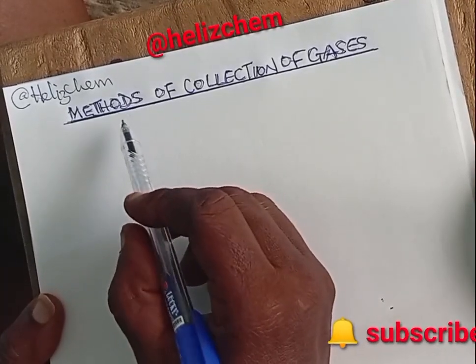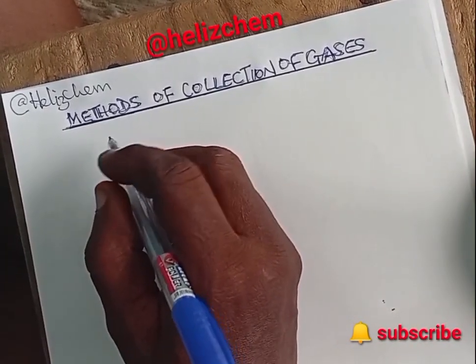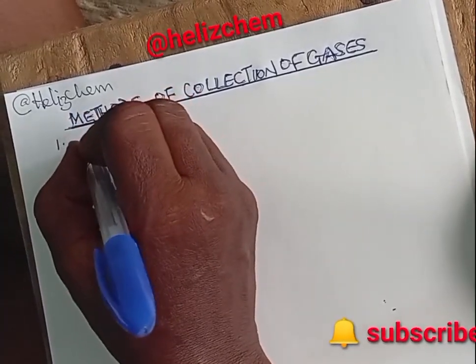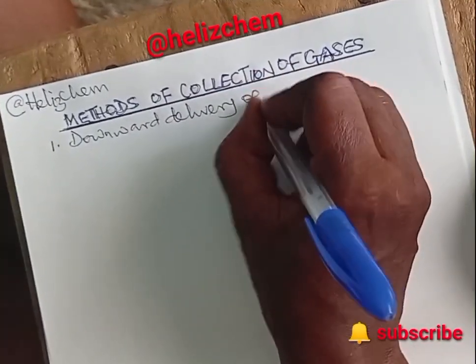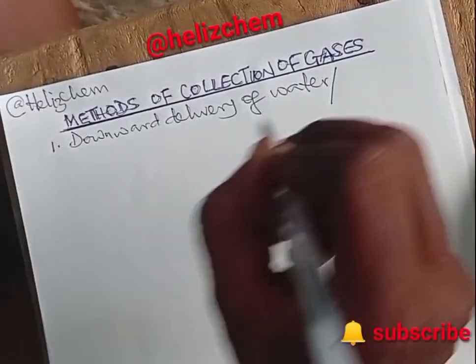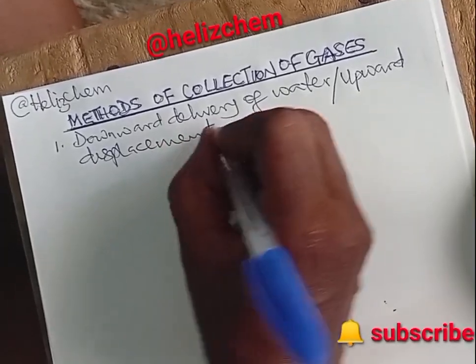We want to look at methods of collection of gases. There are two main methods of gas collection. What are they? One, we have downward delivery of water, or otherwise known as upward displacement of air. Upward displacement of air. That is the first method.